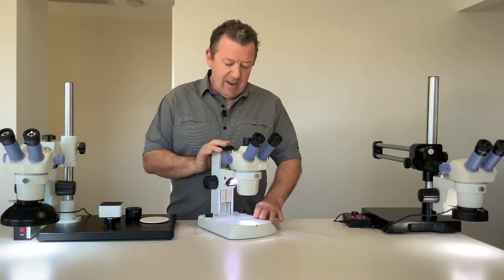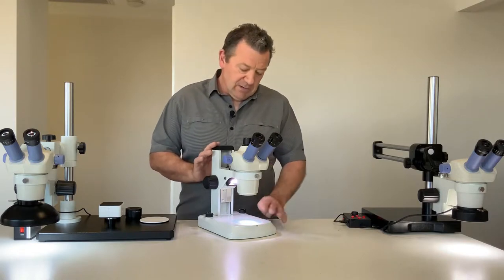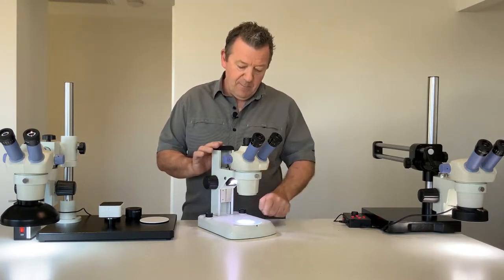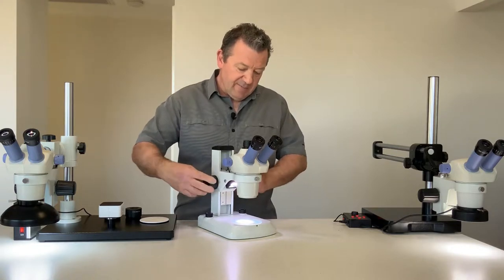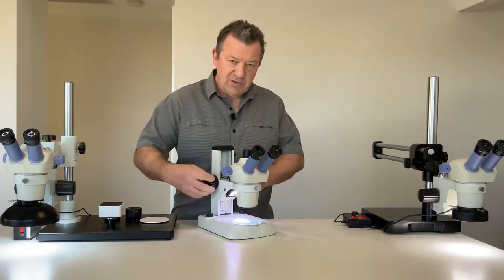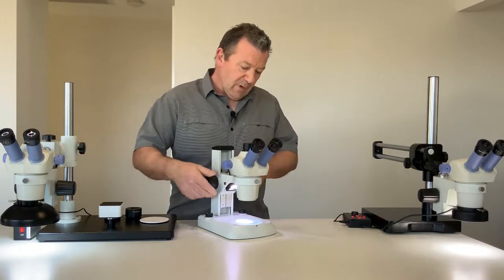This comes with an LED powered upright stand, so it has a top light and a bottom light, both variable intensity LED. With the stand we have the coarse focusing so you can focus your specimen.